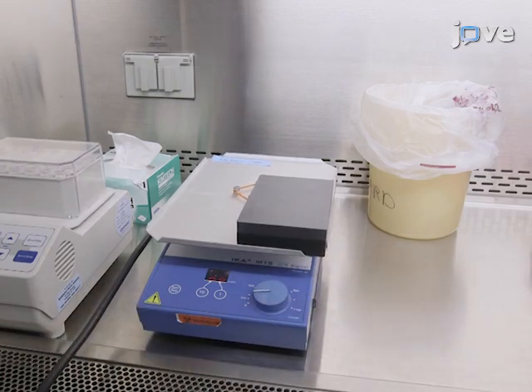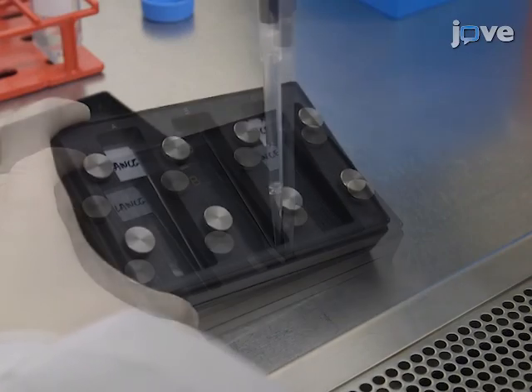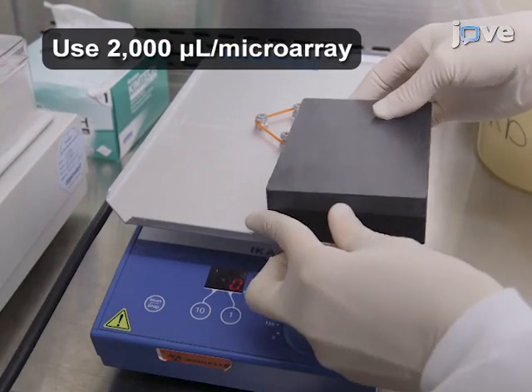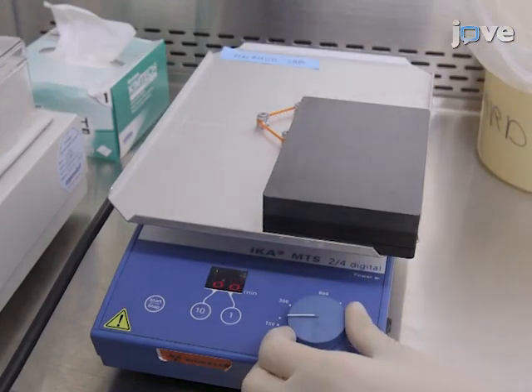Remove the standard buffer by aspirating with a pipette from the corner of the microarray chamber. Then block the microarray with the blocking buffer for 60 minutes at room temperature on an orbital shaker at 140 RPM.